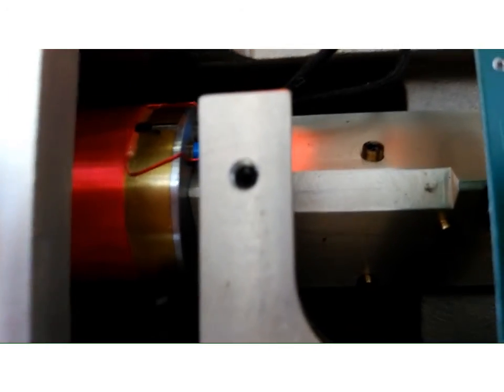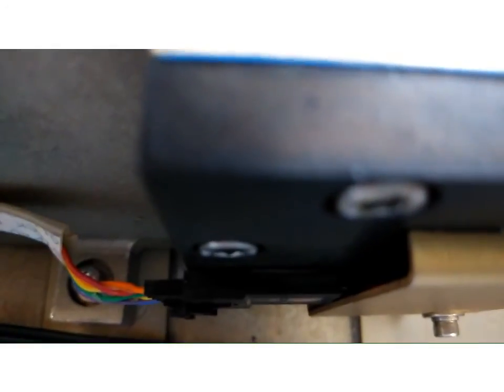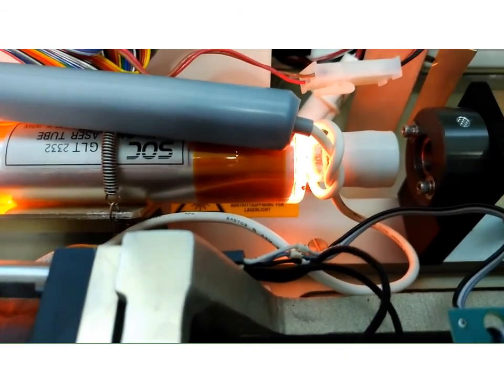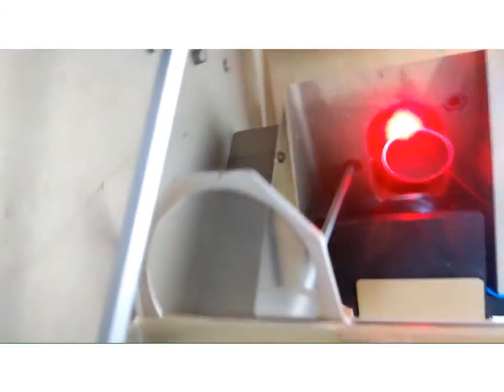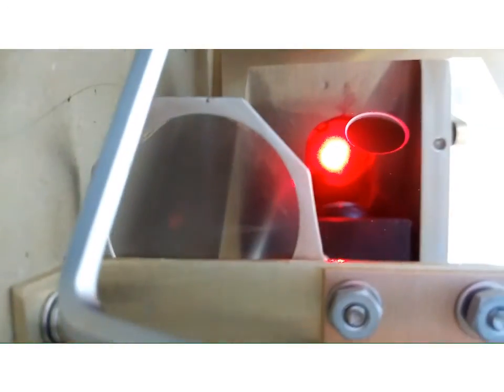This is a helium neon laser. The light of the helium neon laser also enters the interferometer and is used to measure the path difference. Infrared light from the interferometer passes through here and is reflected by this mirror into the sample chamber. Place the sample on this side. Then, it is reflected by this mirror and detected by the detector seen in this part.